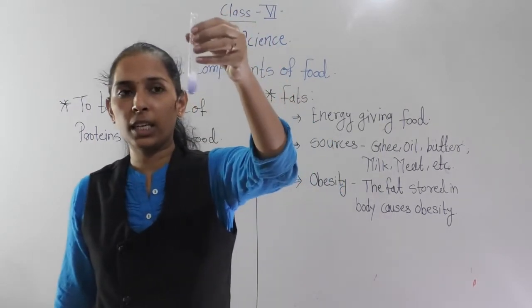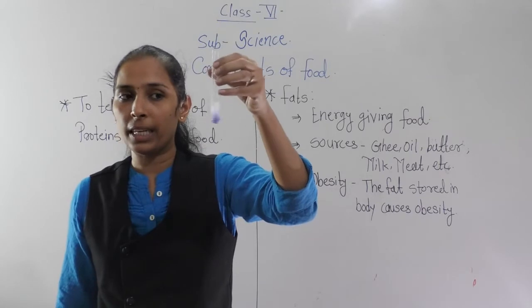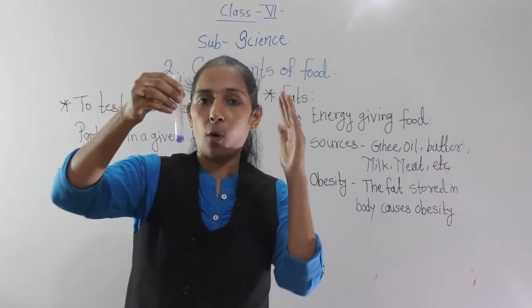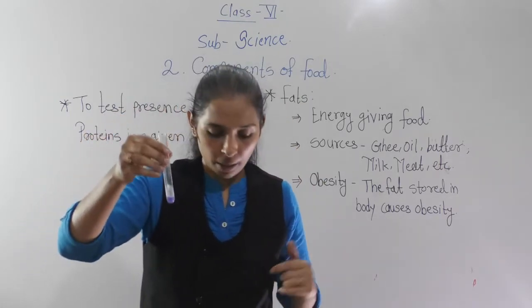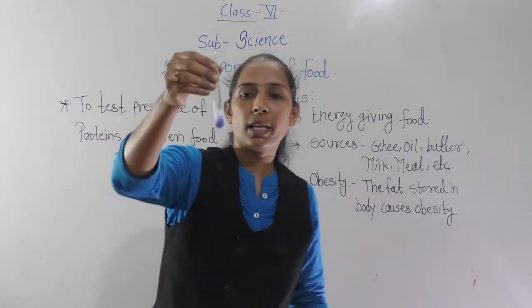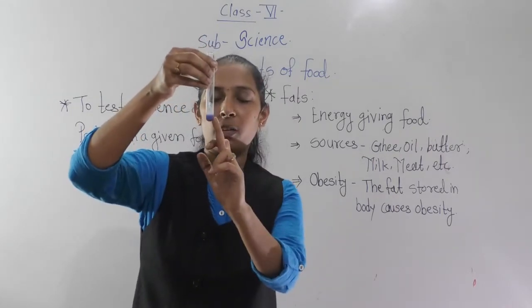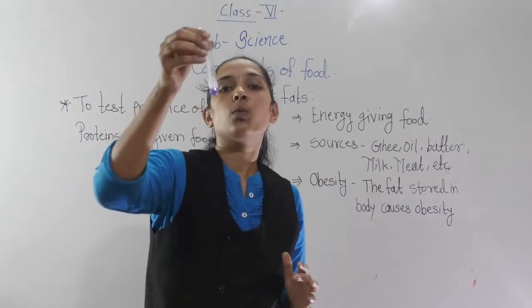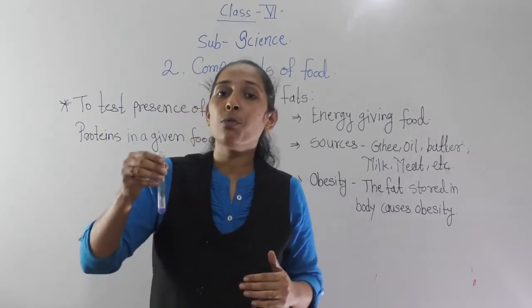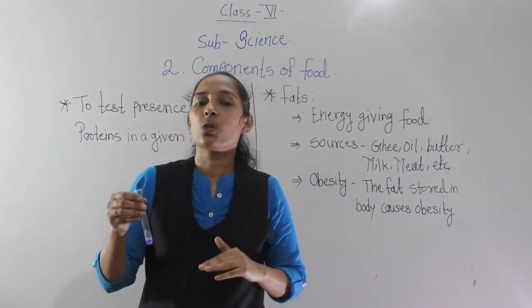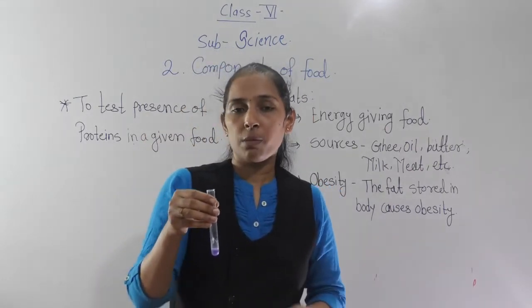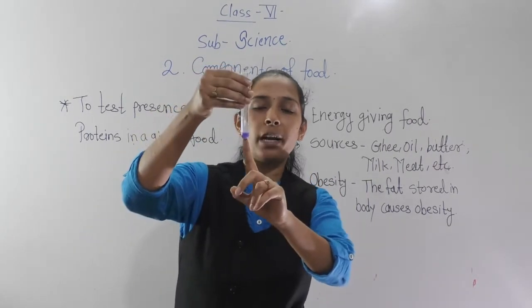So dear students, can you see the change in colour? The colour of milk is white, but when we add these chemicals — copper sulphate solution and sodium hydroxide — we can see a change in colour. We get a violet colour. This violet colour in our conclusion indicates that the given food sample, which is milk, contains protein in it. Because by adding the chemicals, it produces the violet colour.